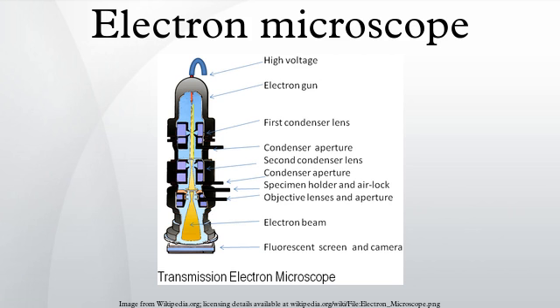Generally, the image resolution of an SEM is at least an order of magnitude poorer than that of a TEM. However, because the SEM image relies on surface processes rather than transmission, it is able to image bulk samples up to many centimeters in size and has a great depth of field, and so can produce images that are good representations of the three-dimensional shape of the sample.